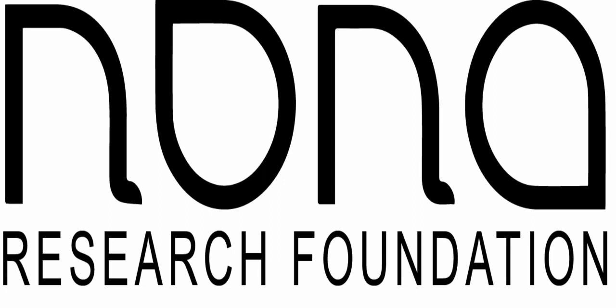Or maybe LIMS needs to be a little more focused on a workflow engine. Maybe it's something to say, well, let's integrate this with Airflow, which is an open source workflow engine of sorts that does a lot more on the bioinformatics side. If we can easily have this sample get a session and then say, let's send this over to Airflow and see if the results were good or bad. It takes some coding in Airflow to say, hey, this is how I want my pipeline to be processed. But finding out that platform and starting to set up fundamentals is a challenge that I think we could talk about for hours, but we don't have that much time.